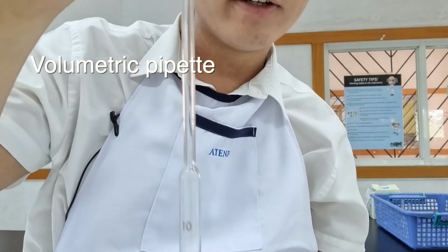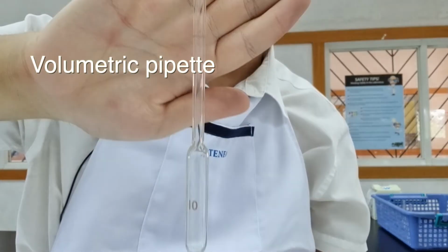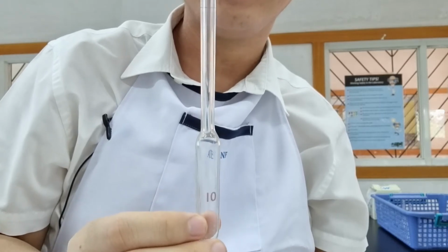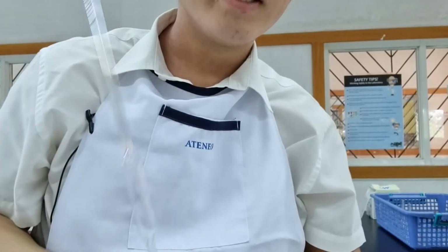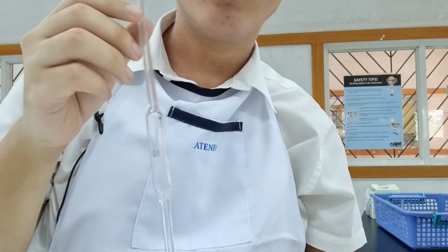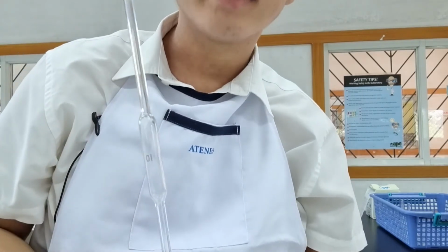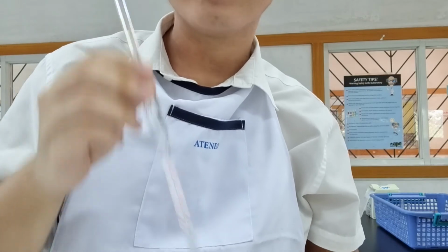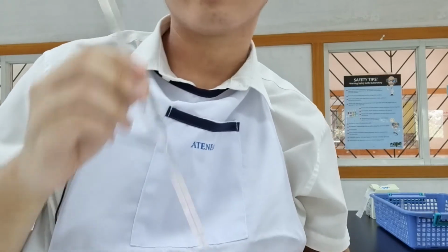I have here a 10 ml volumetric pipette. So the volumetric pipette has one line, and this is 10 ml. Again, it's still TD. So when you fill this up to the mark and you allow it to drain, you are delivering 10 ml, but inside it's not necessarily 10 ml. It's calibrated to deliver and not contain.